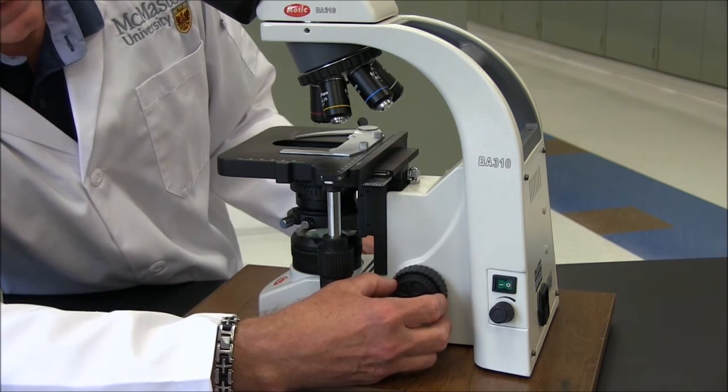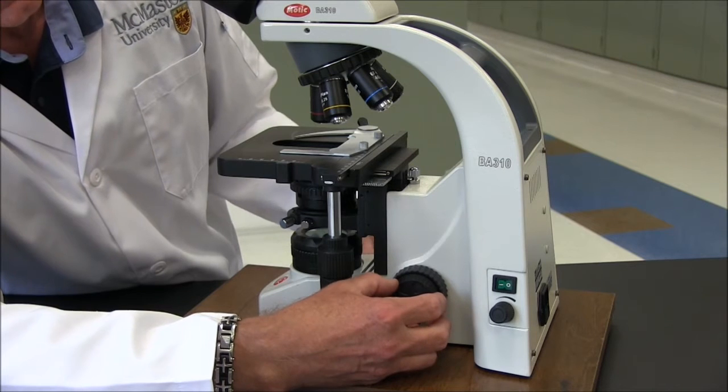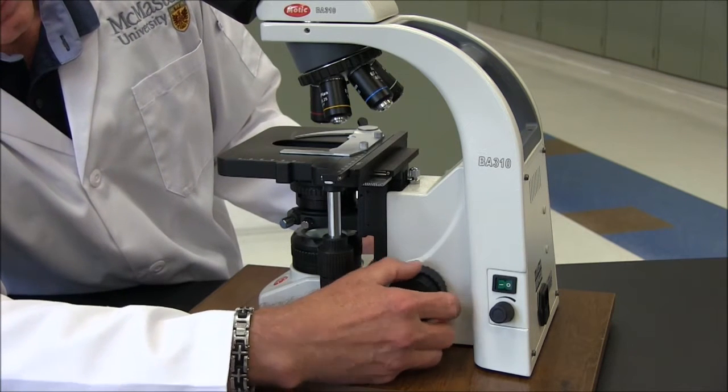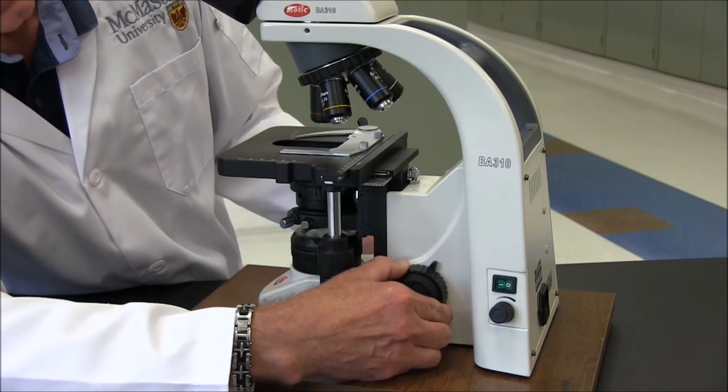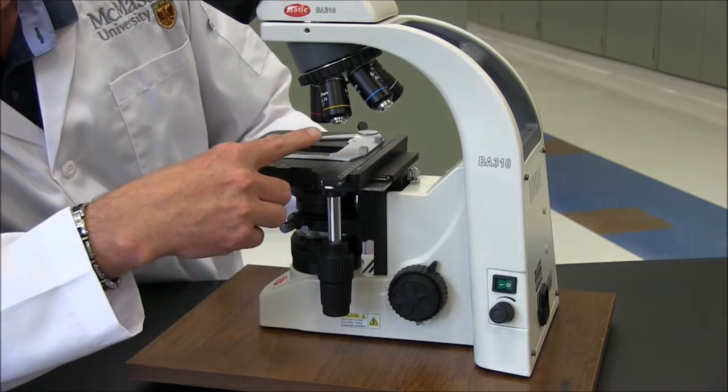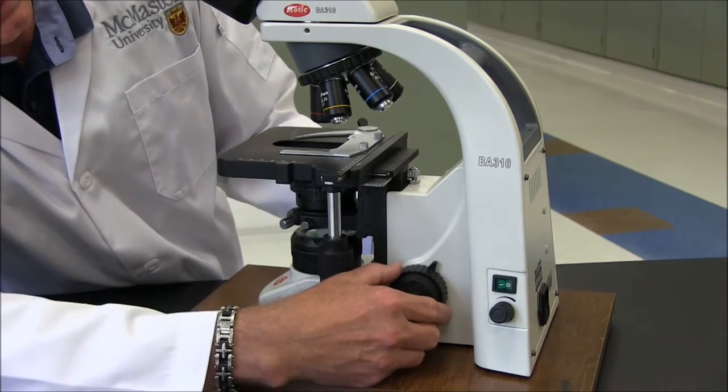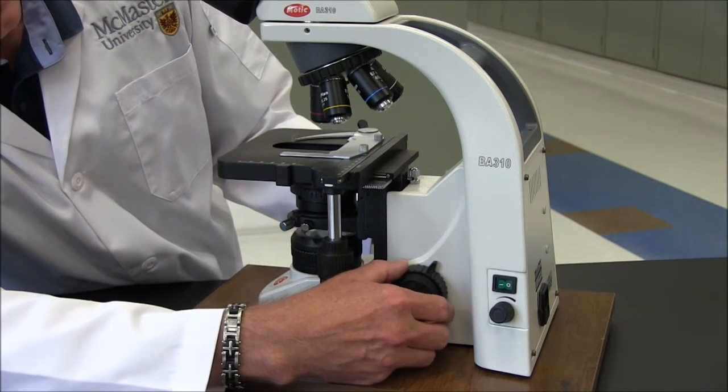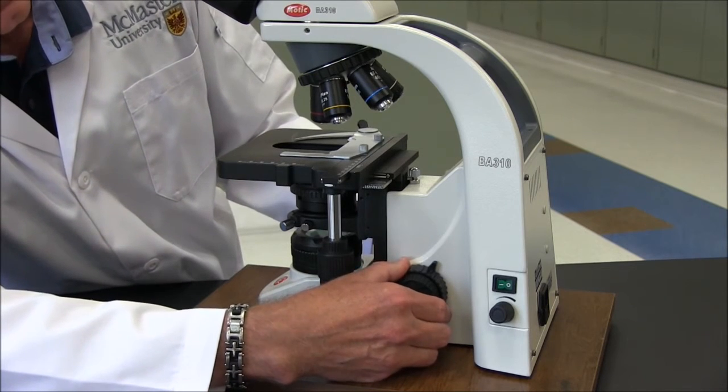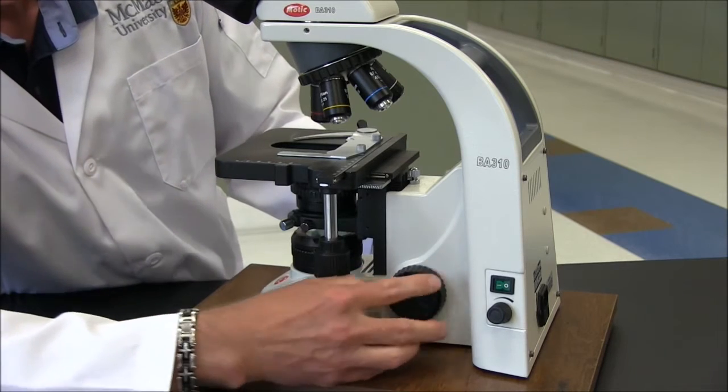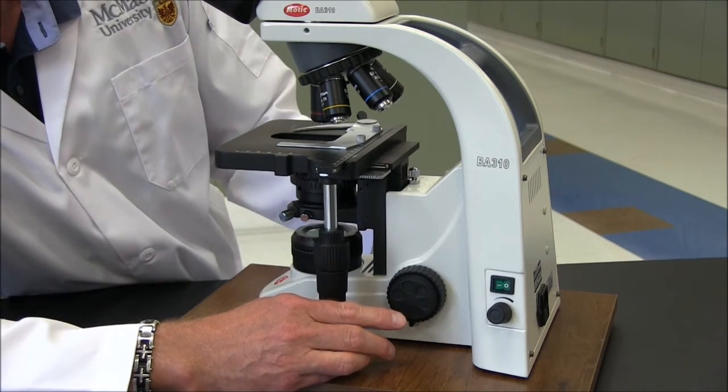The other buttons on this side are the fine focus knob, which is also on the left side, and the upper limit stopper, which when it's in the locked position, limits how high this stage will go up towards the objectives. Normally you don't need this, but if you sit down at the microscope and you realize it's not working properly, check to see that this isn't locked. If it is, just release it. You should be able to move it freely up and down.